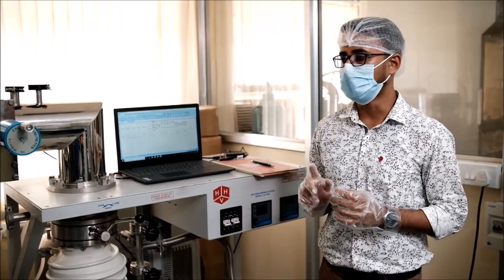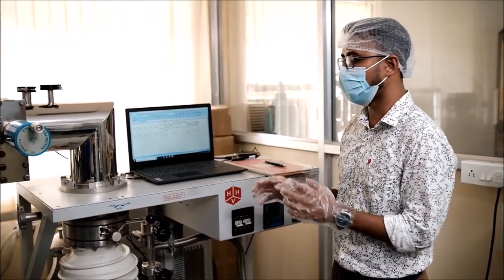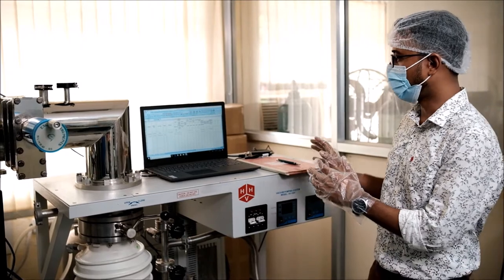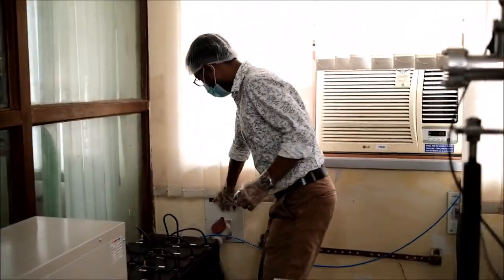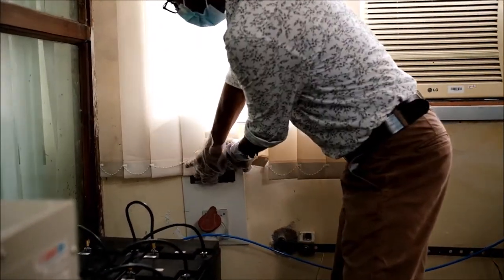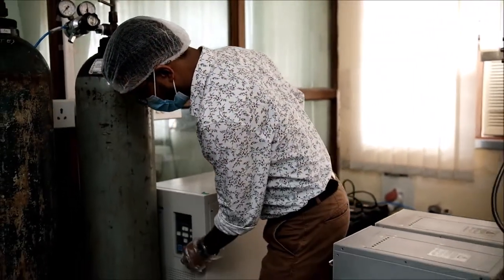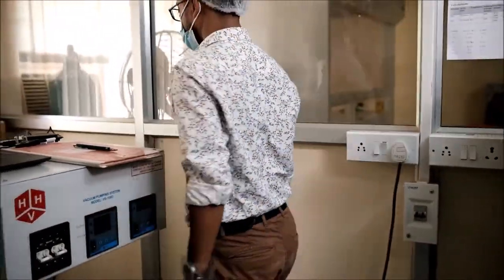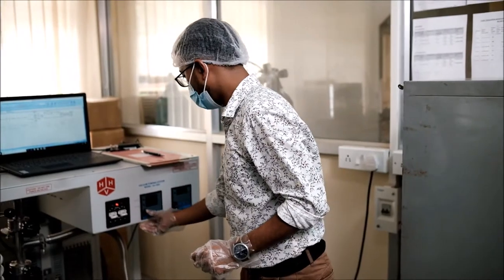Before we start the deposition, we first make an entry in the logbook — we have a soft copy and also a hard copy — entering all the detailed deposition parameters. After making the entry, we will start the deposition. First we power up the system: we switch on the MCB of the UPS, then switch on the UPS, and then one by one switch on all the switches.